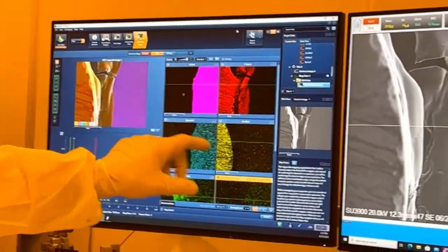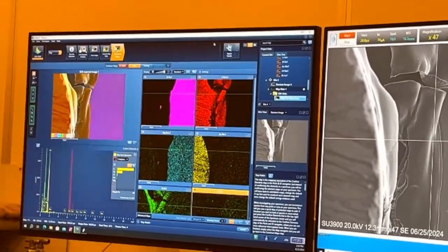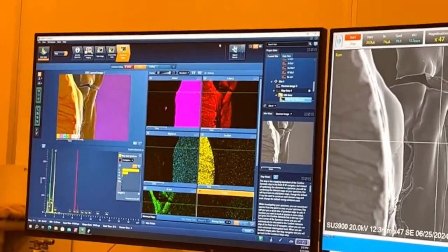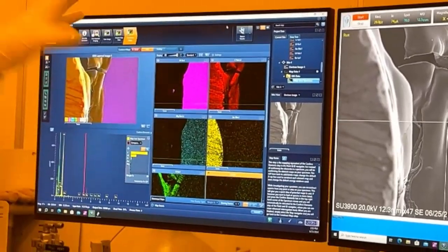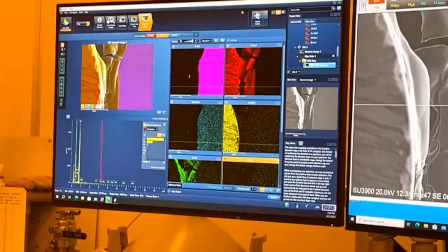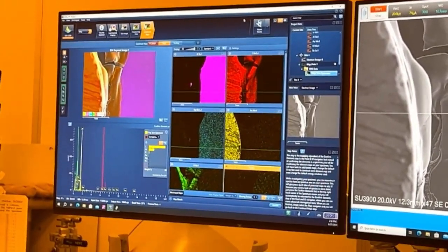So now it's showing, okay, this is aluminum, right? But look, I got a little bit in here, the concentration of carbon. My gold, I guess gold should be yellow, right? So the longer you let this go, the more accurate it'll be, fill in, and then it has the colors here. And then it shows our percentages here.